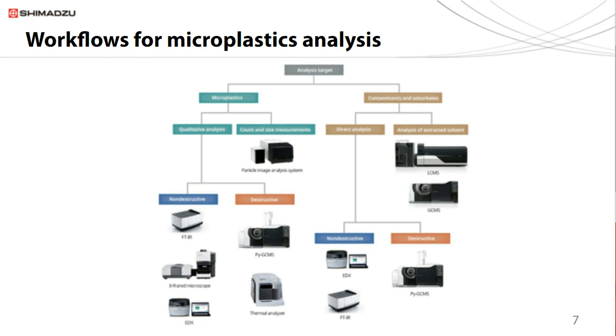Finally, and before Sudhir starts his portion of the presentation, I want to just show you the different analytical instruments that are required to fully characterize the microplastics, depending on the question you have. You want to count them, you want to determine the size, you want to analyze the material.